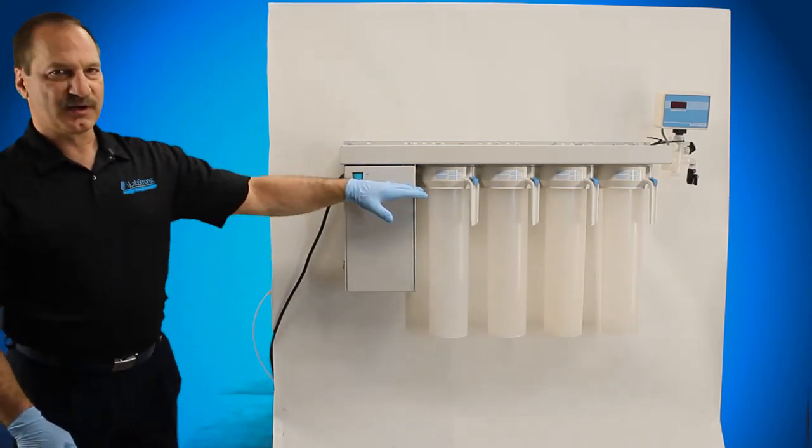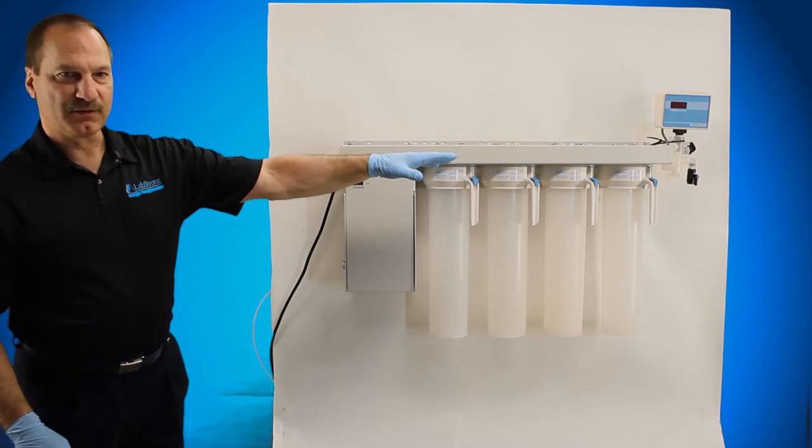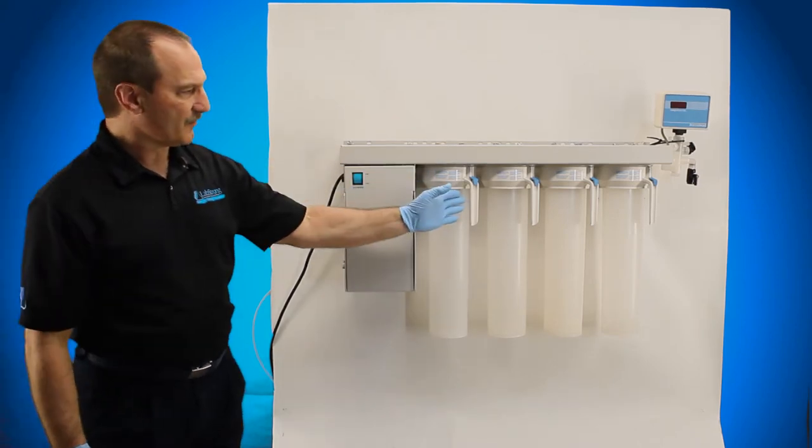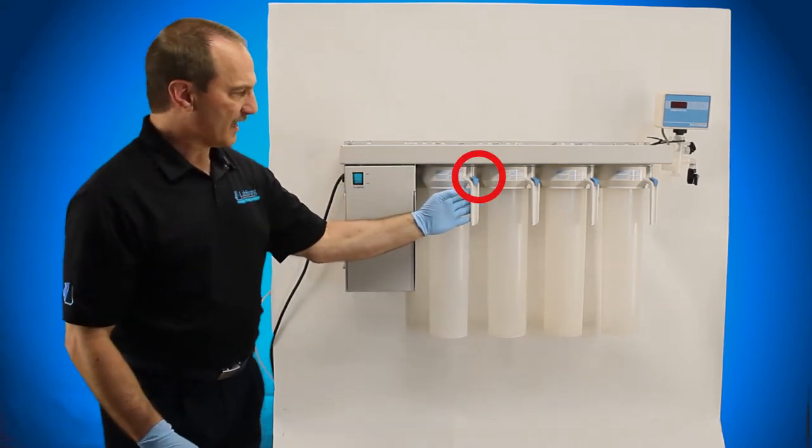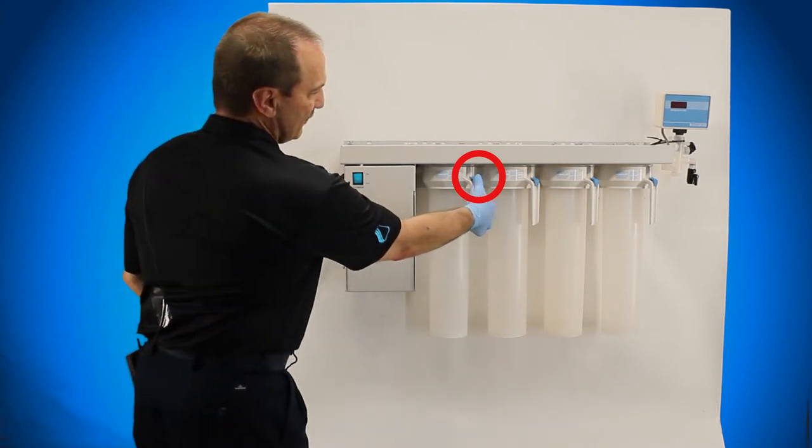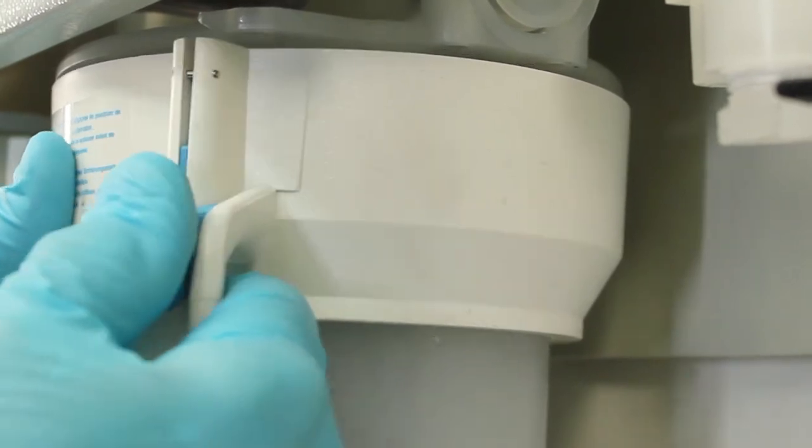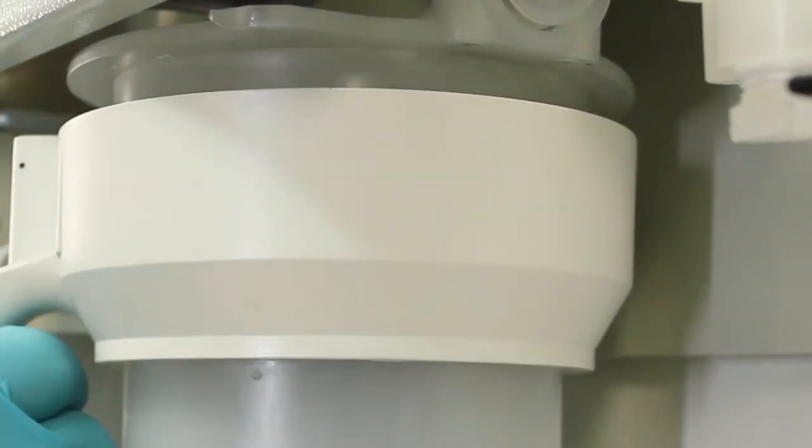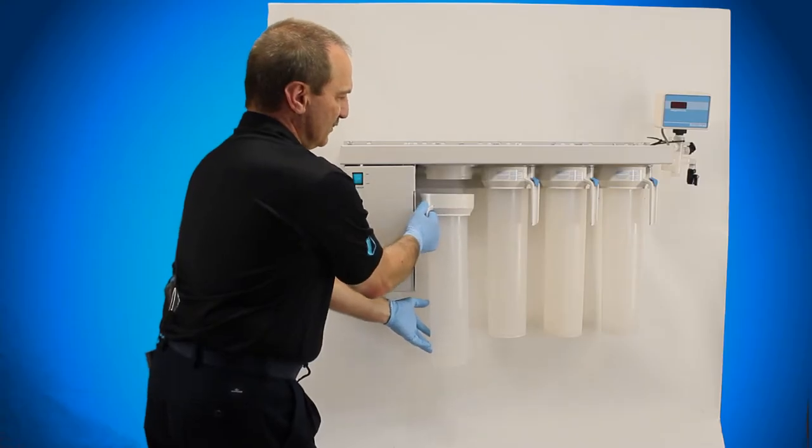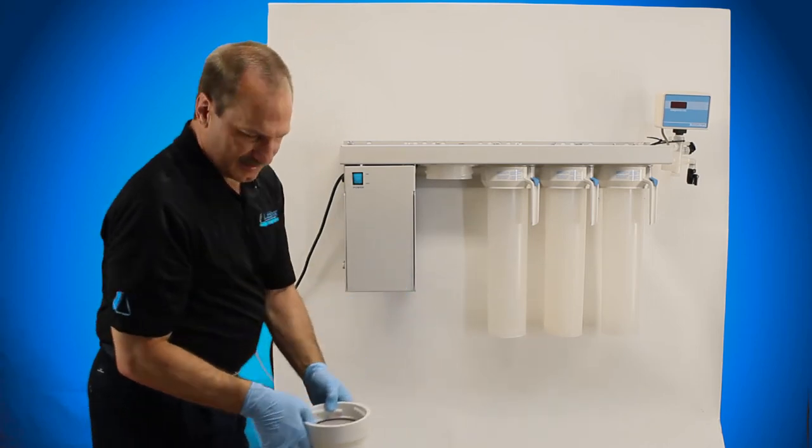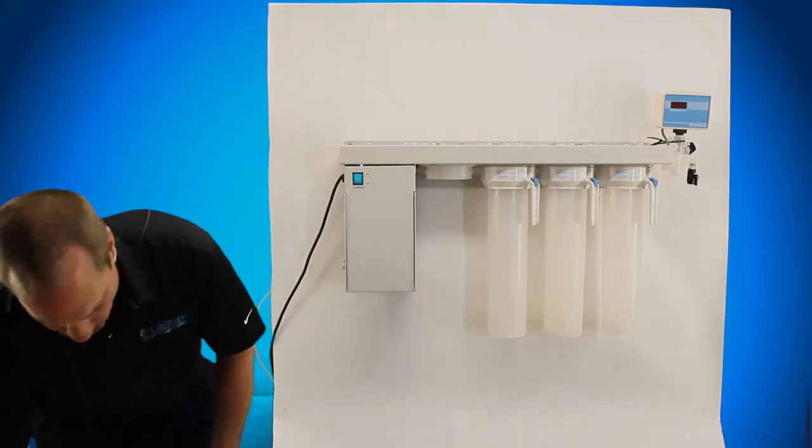Once the system is depressurized and you no longer have any water coming out of your valve, then you're going to want to take off your quarter turn locking canisters. To do that, you're going to pull down on this ring handle. You're going to quarter turn, pull it, drop it down, and then set it aside. You want to do that for all four.